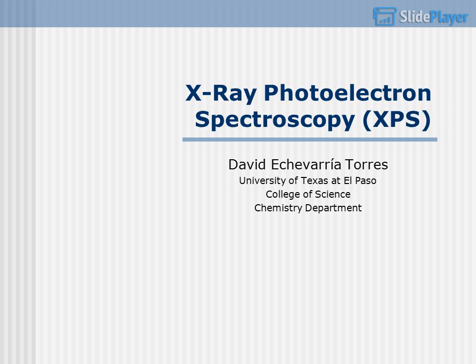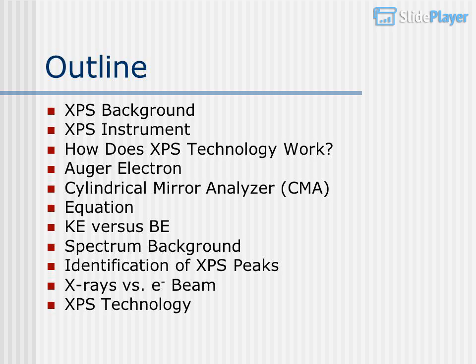X-ray photoelectron spectroscopy, XPS. David Echevarria Torres, University of Texas at El Paso, College of Science, Chemistry Department. Outline: XPS background, XPS instrument. How does XPS technology work?